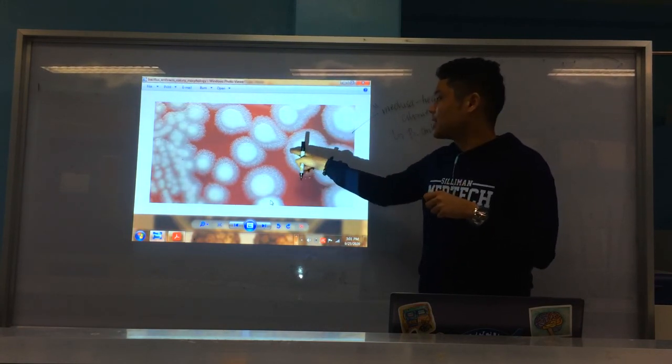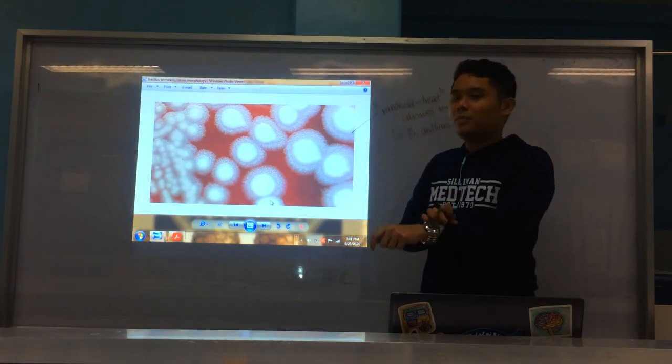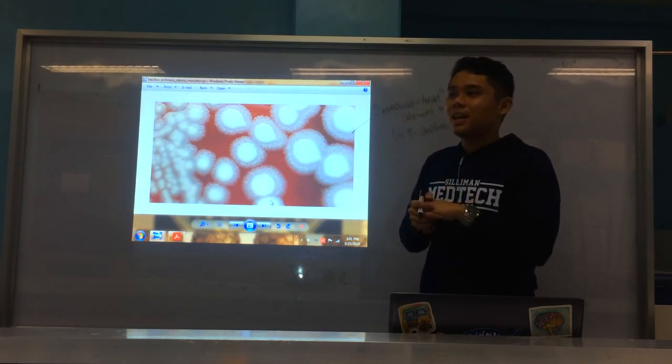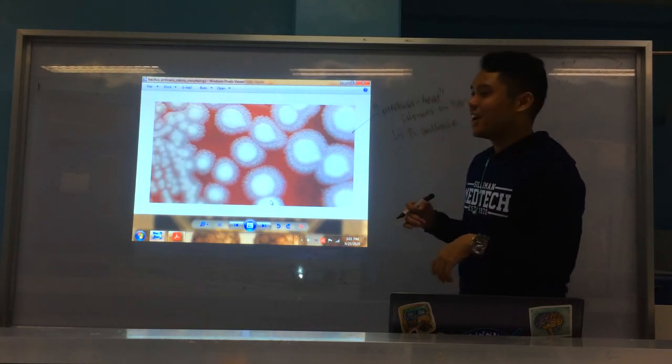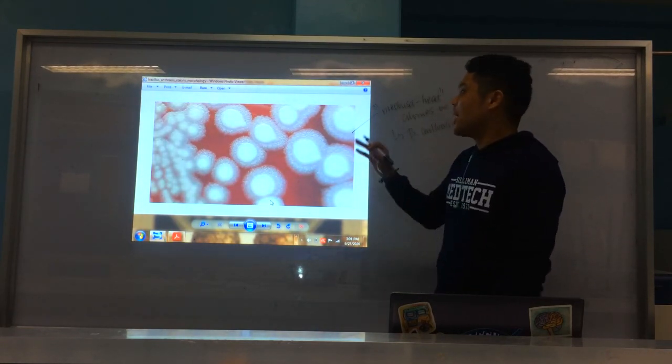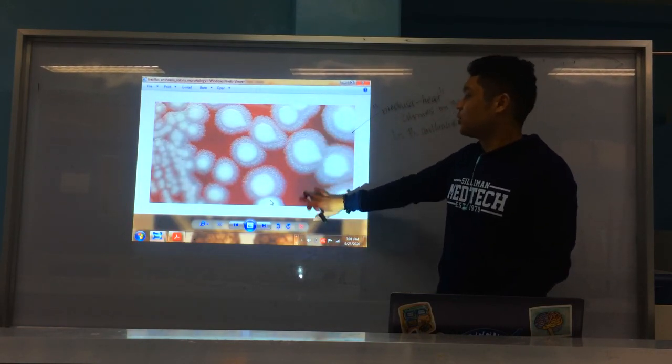Okay, as you can see, di ba, magmuni siya ang head kuno ni Medusa and then muni mga snakes. Alright, di ba, Medusa, snakes iyahang hair. Okay, because gi-curse siya ni Athena. Kay gi-rape siya ni Poseidon sa temple ni Athena. Oh, that's another topic. Okay, anyway, I love it. I love Greek mythology. Anyway, again, Medusa head colonies, Bacillus anthracis. Okay? Again, cover photo sa section D.